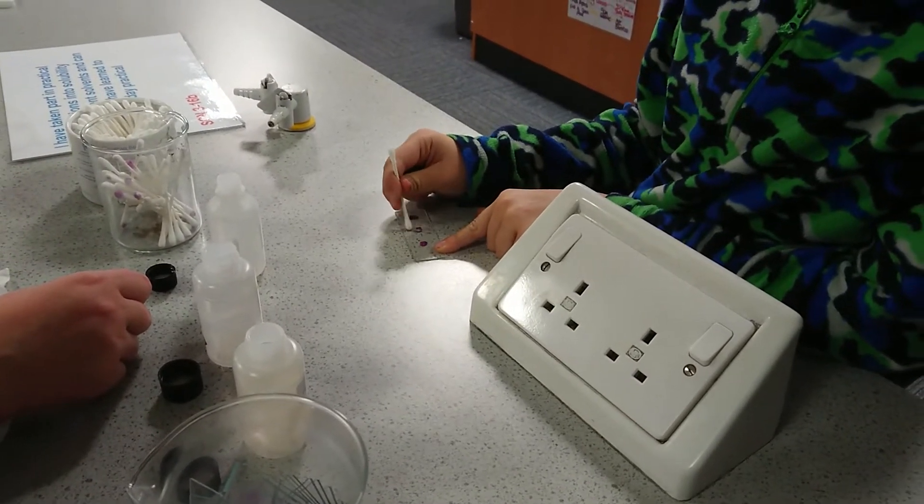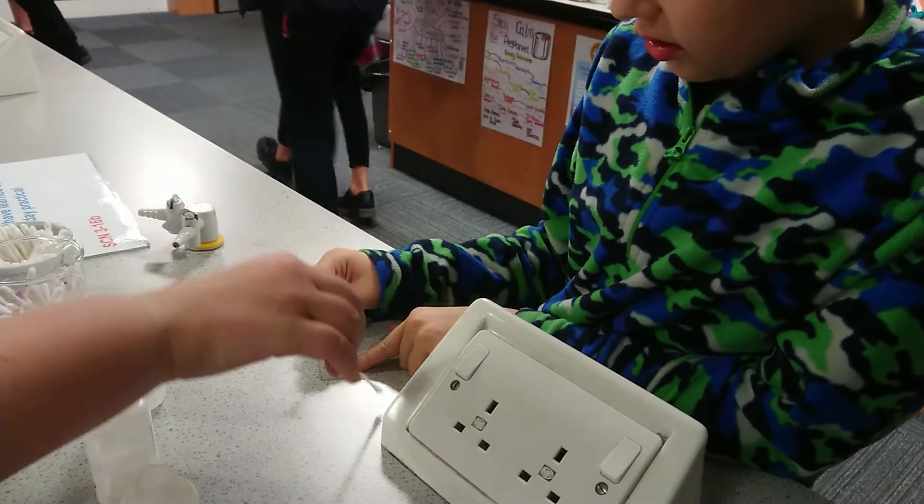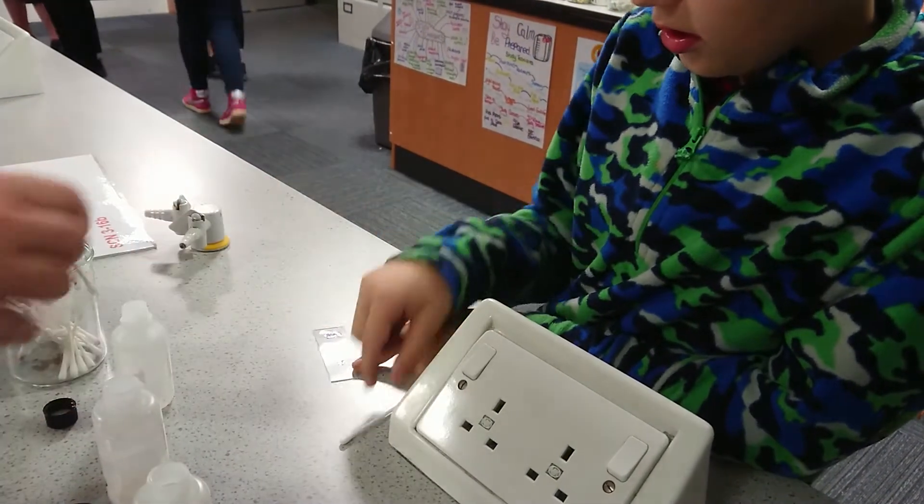Yeah, it works. We're also going to try ethanol as well. Take that and dip it in the middle one.